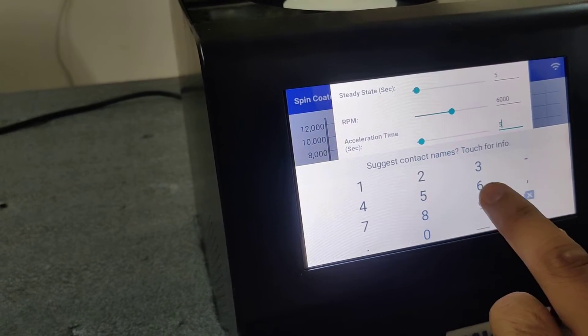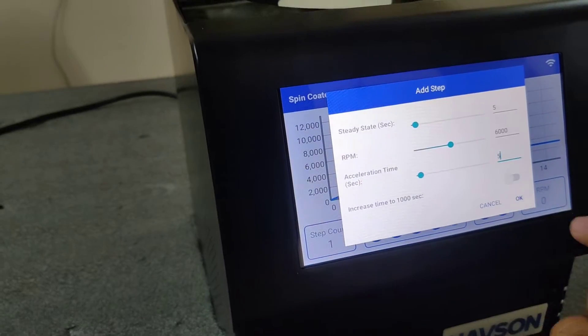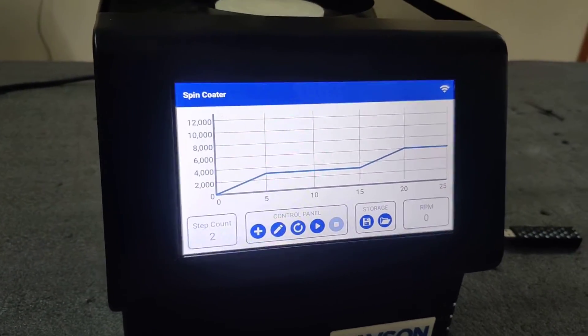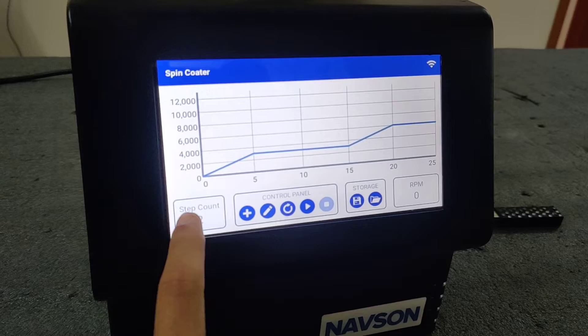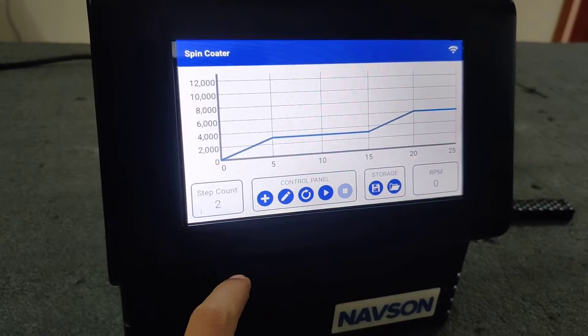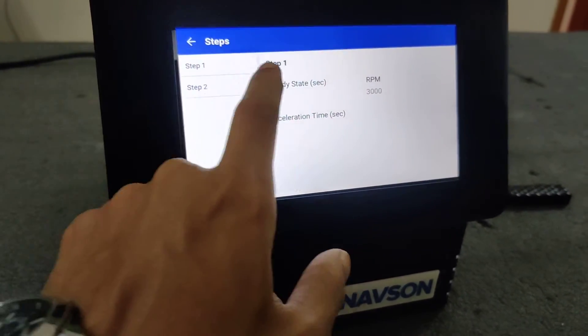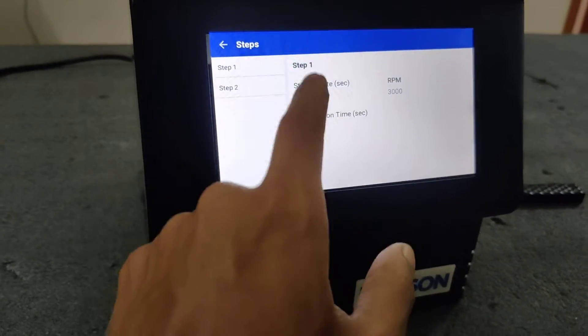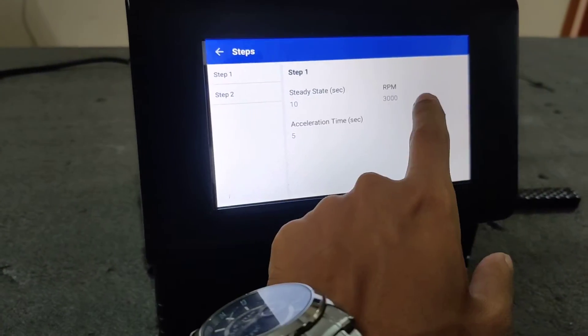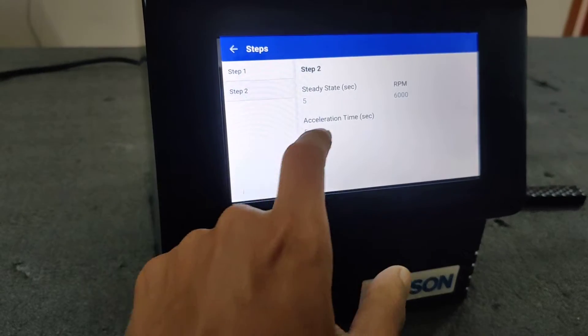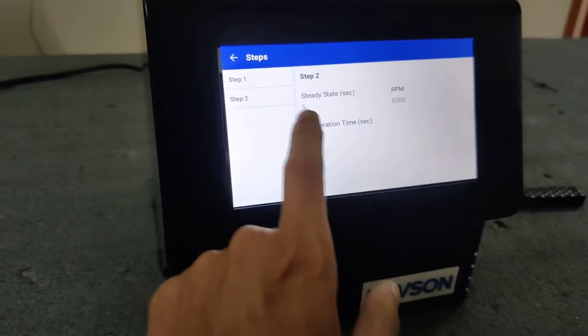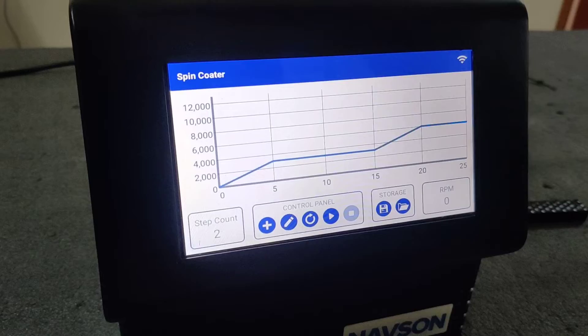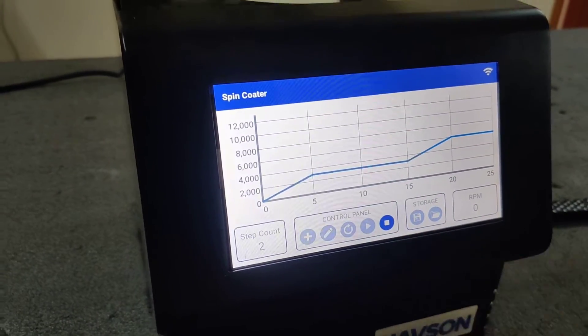Okay, so this is the... there are two steps added. So you can go to step count and see step one is 3000 RPM for 10 seconds and it takes 5 seconds to reach 3000 RPM. Step two again, those details. Now we will play it.